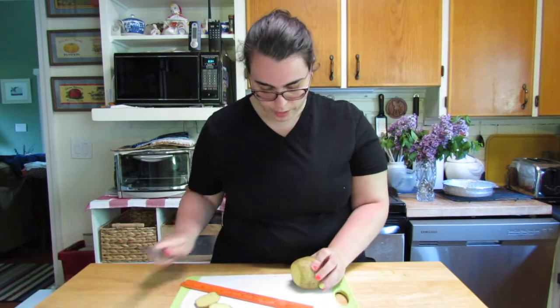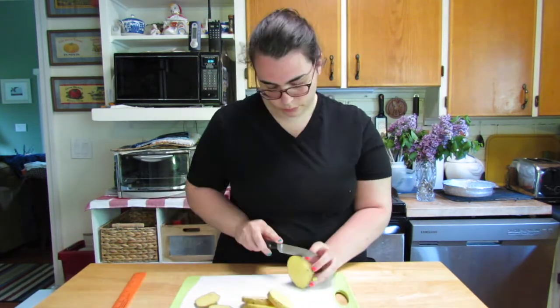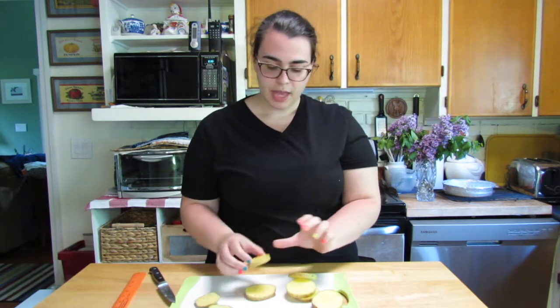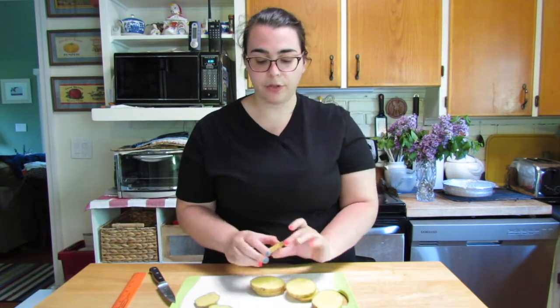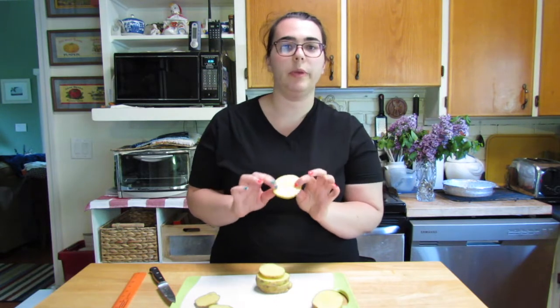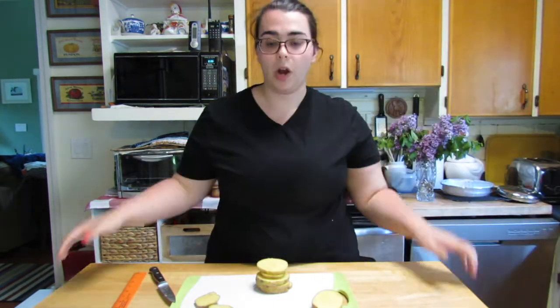I want the slices to be about a quarter inch thick. Alright, so these are going to become my petri dishes. Now that I've sliced them, we have to cook them and boil them. So I'm going to start a pot of water and boil these potatoes until they're roughly the softness that they would be for me to eat them. I'm going to wait for this water to boil and cook these potatoes.